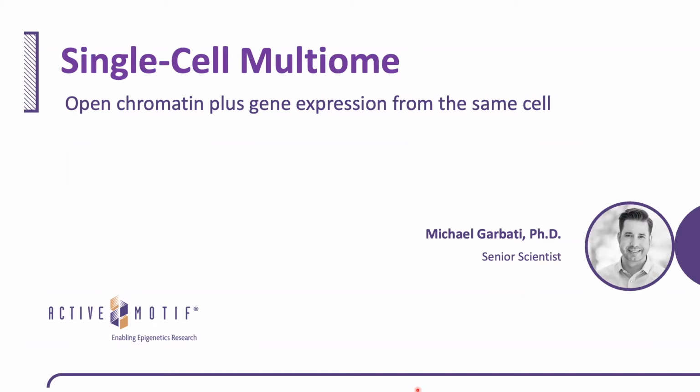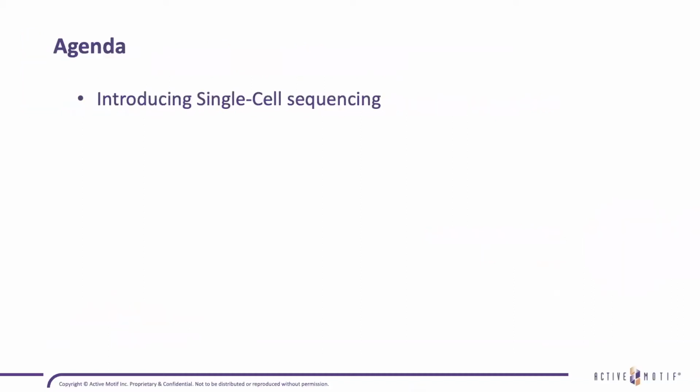And today he'll be talking about single-cell multiome, the open chromatin plus gene expression within the same cell. So I'll turn it over to you. Thanks, Mason. Today, we're going to start off by introducing single-cell sequencing and compare it to bulk sequencing.